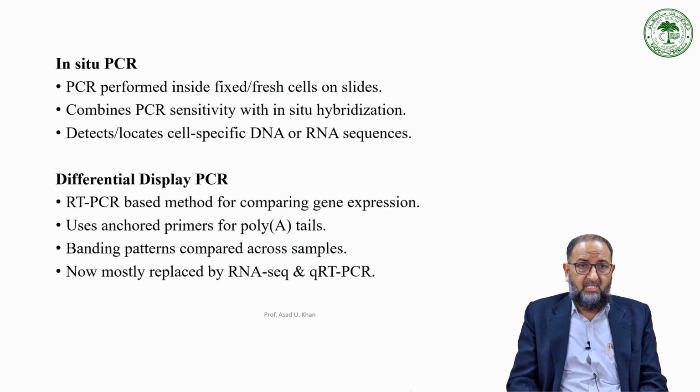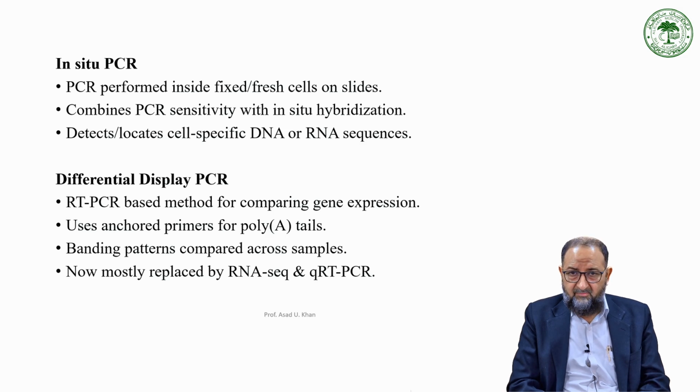In situ PCR is PCR performed inside fixed fresh cells on slides. This is how in situ technology combines PCR sensitivity with in situ hybridization. It detects and locates cell-specific DNA or RNA sequences.